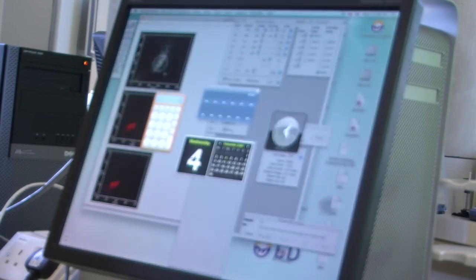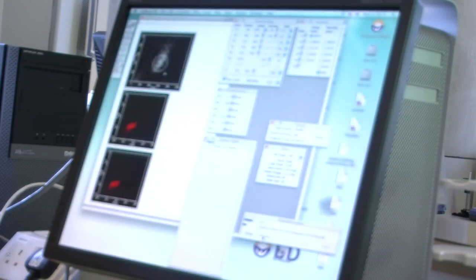Right. Whoa. Up in there. I have no idea what that was. Oh, nice fluorescence there. It's much stronger. So tube 2 is stronger than tube 1 in all 4 markers, it would appear.